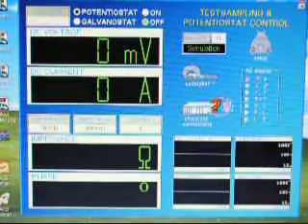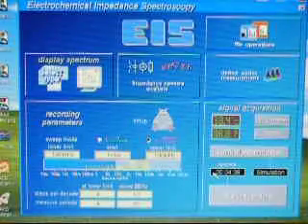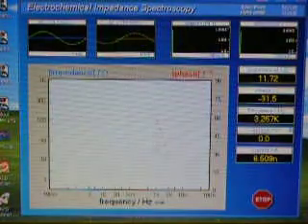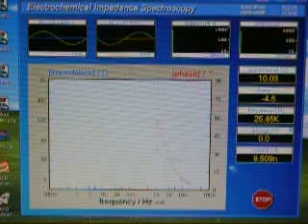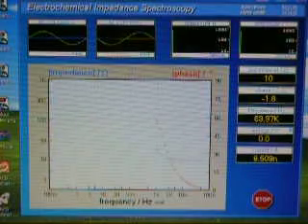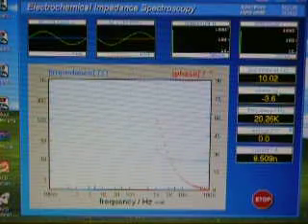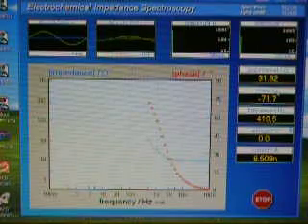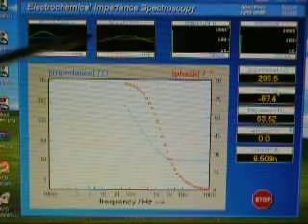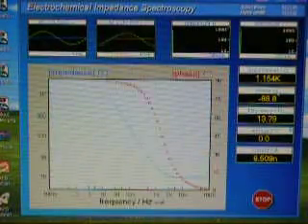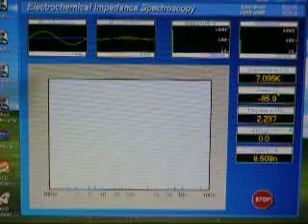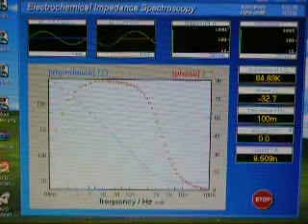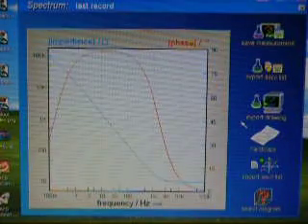Going back to the main screen, we're ready to go. We'll click start recording and then have the starting frequency — we'll sweep up and then sweep down. You can see we have real-time displays: power spectrum density showing a very clean fundamental, and the fundamental waveforms being shown — AC current, AC voltage. The y-axis auto-scales as we're acquiring data.